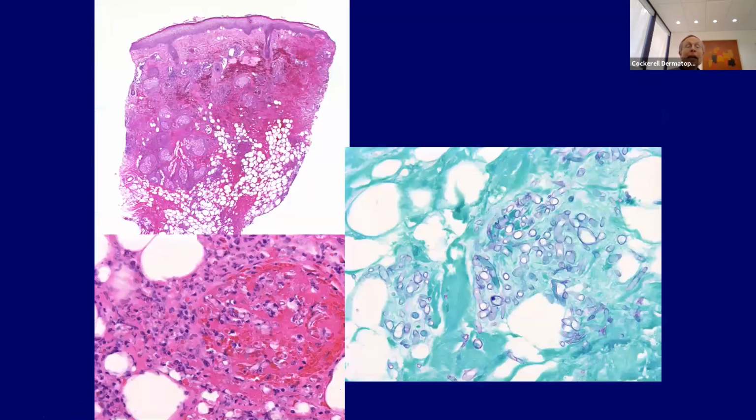This was an example of a patient that had a zygomycotic infection, and notice there's no inflammation up here in the dermis really, it's all in the subcutaneous fat, and the blood vessel here is chock full of these organisms that are causing thrombosis. There's all this inflammation in the lobules, and then with this special PAS stain, you can see all of these hyphal elements with a relatively sparse amount of inflammation due to a zygomycotic infection. I think this patient had mucor. In this case, it was growing in the fat. So mucor, Absidia, and rhizopus can get into the subcutaneous fat to get these non-septate hyphae involving the fat diffusely.